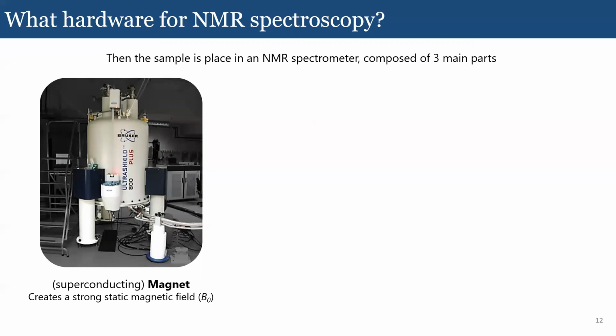Okay, so I'm just going a bit ahead of the rest of the talk, but the size of the rotor is going to dictate 2 things. First, it's going to dictate the amount of sample you can put at one time in your spectrometer.